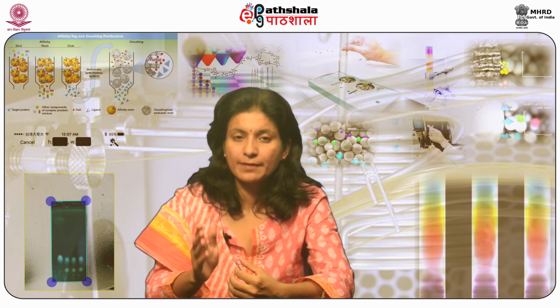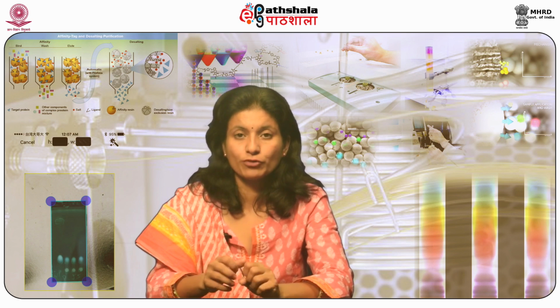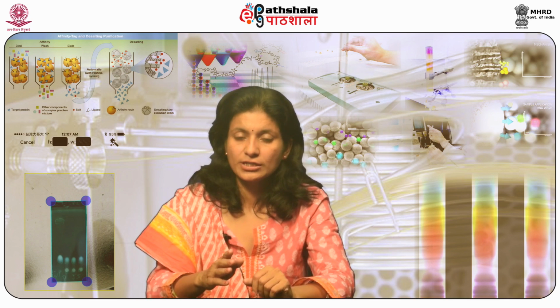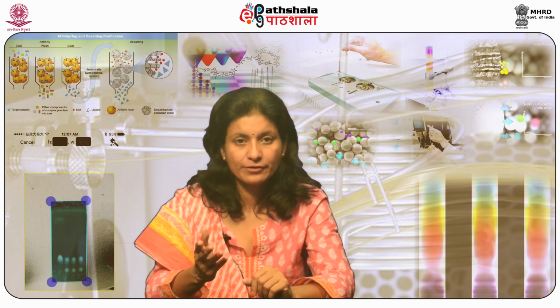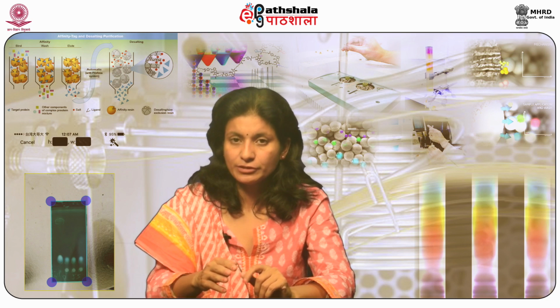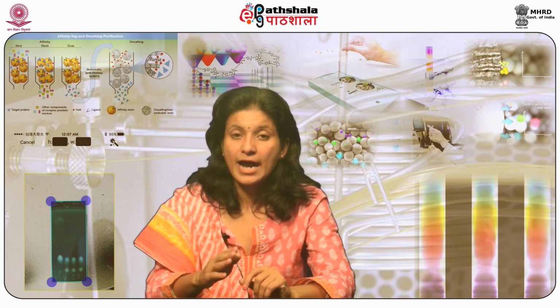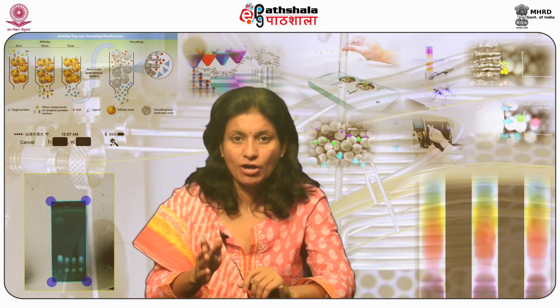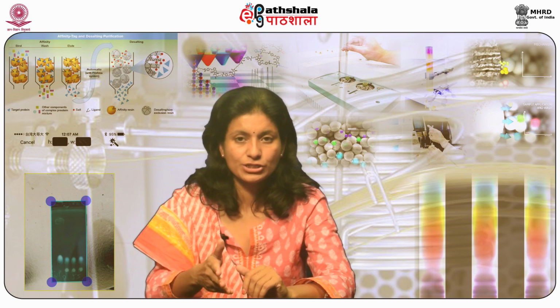Similar types of molecules that would be difficult to separate by other techniques, due to the charge carried by the molecule of interest, can be easily separated by changing buffer, pH, etc. Ion exchange chromatography is a vital analytical technique for the discrimination and segregation of ionic compounds, along with ion interaction or partition and ion exclusion chromatography.